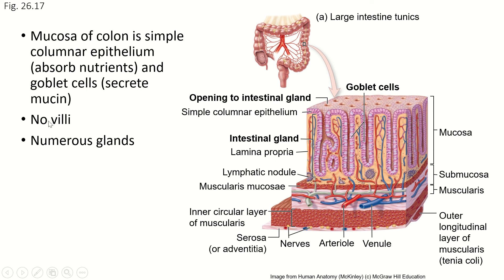So we don't see villi here. We do see lots and lots of glands, a really deep lamina propria, and the submucosa is thinner. We only have the circular layer of muscle; the longitudinal layer has been narrowed and reduced — that's the taenia coli.